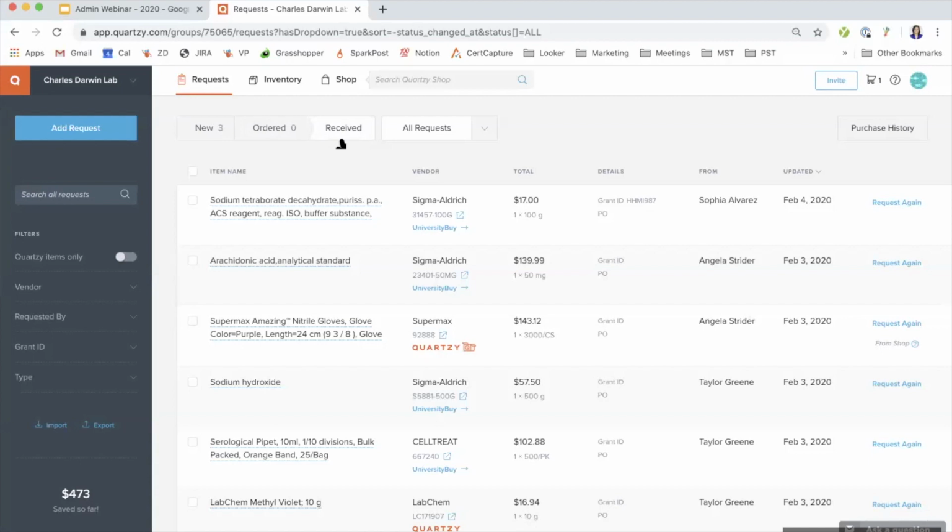All right, and Renee is asking about a tab in the order request flow for marking an item as being paid for. Yeah, so having a more customized kind of workflow, something like paid, maybe one level of approval or a second level of approval. I know sometimes those are steps that labs have.